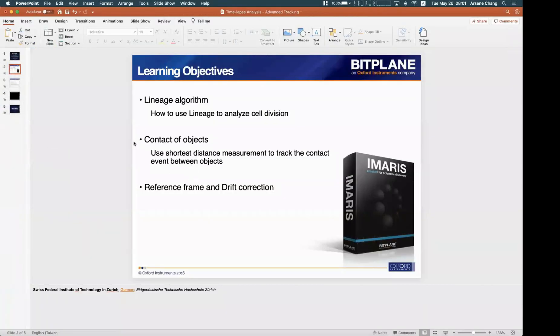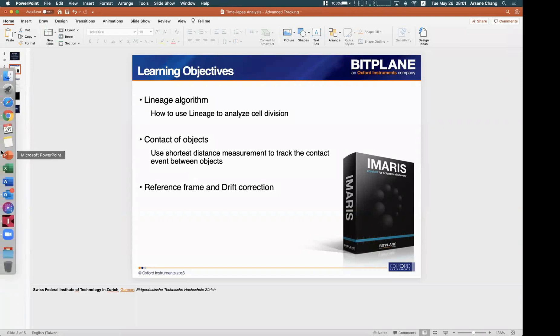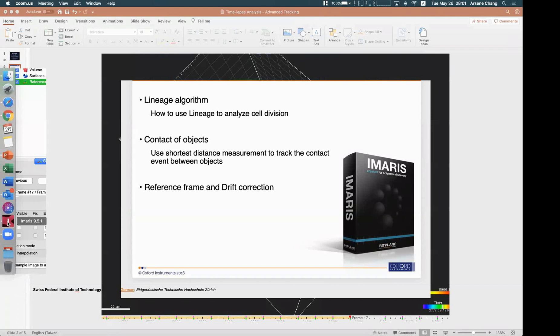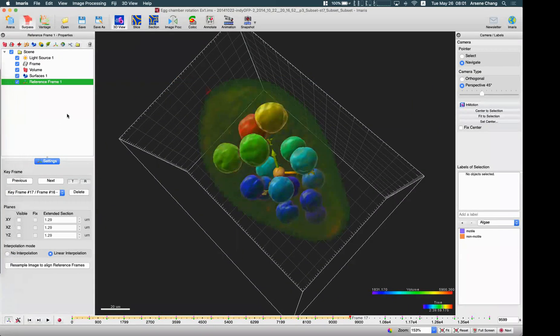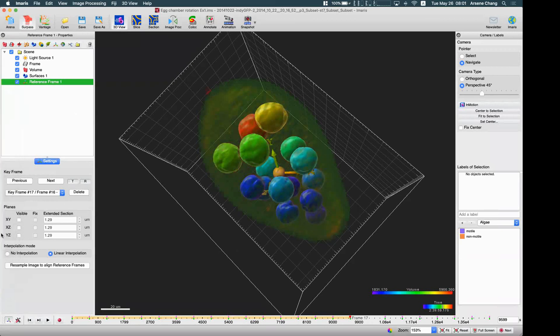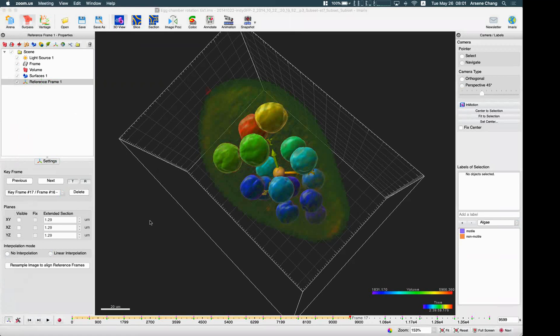That is another usage of reference frame in tracking. I think that is all the points I wanted to make today in this training. The contact analysis brought me back to when I first started doing this sort of analysis in Imaris — I spent hours and hours tracking each of those cells individually and looking whether they touched the other cell. That would have made my research a lot easier in the beginning.